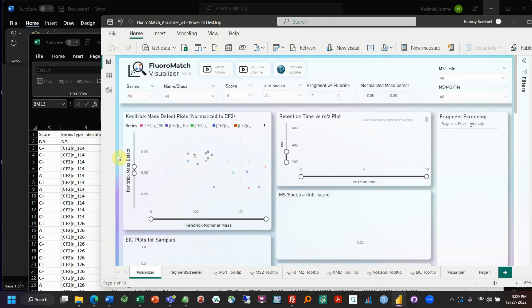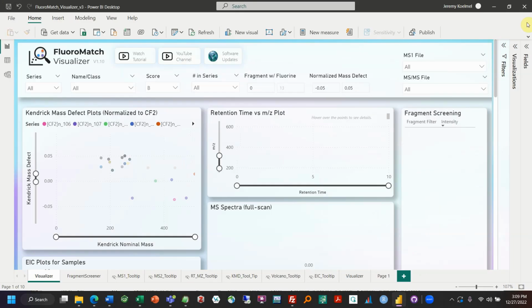All right, so that's it for part 2. In part 3, we're going to go over discovering new PFAS or series that potentially don't have any annotations.